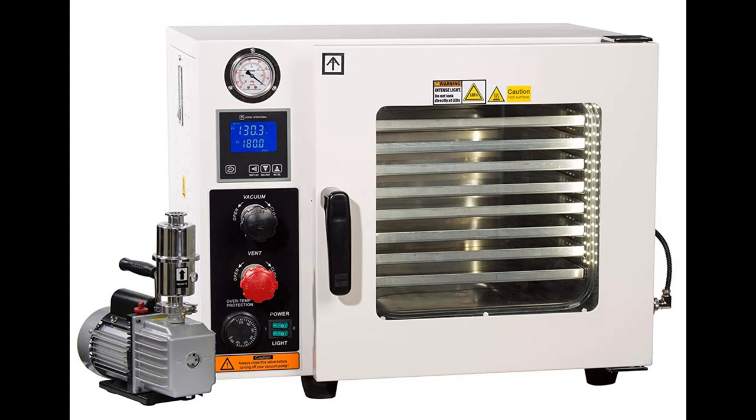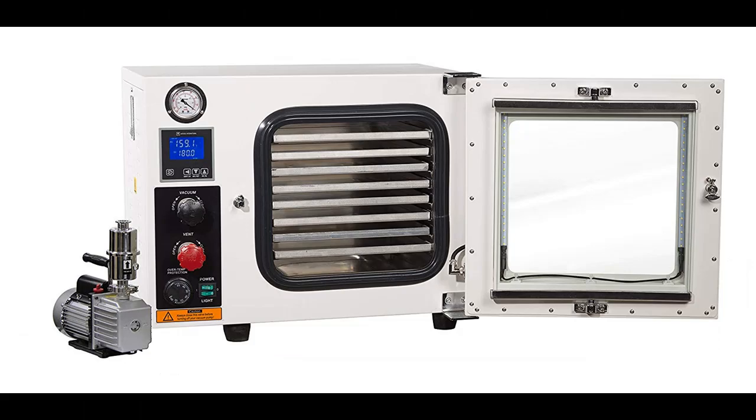The IACUTEMP 0.9 cubic foot vacuum oven comes standard with all stainless steel tubing, compression fittings, stainless steel vacuum and vent valves, an oil-filled vacuum gauge, five-sided heating technology, and a two-year warranty.